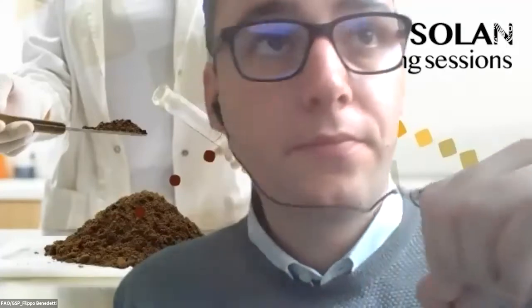I think we follow all these questions. Manal, do you want to take the question? The question is, can we determine the organic matter in these methods? The answer is no, we cannot do that. We can determine the organic matter or organic carbon by other ways, by potassium dichromate methods.